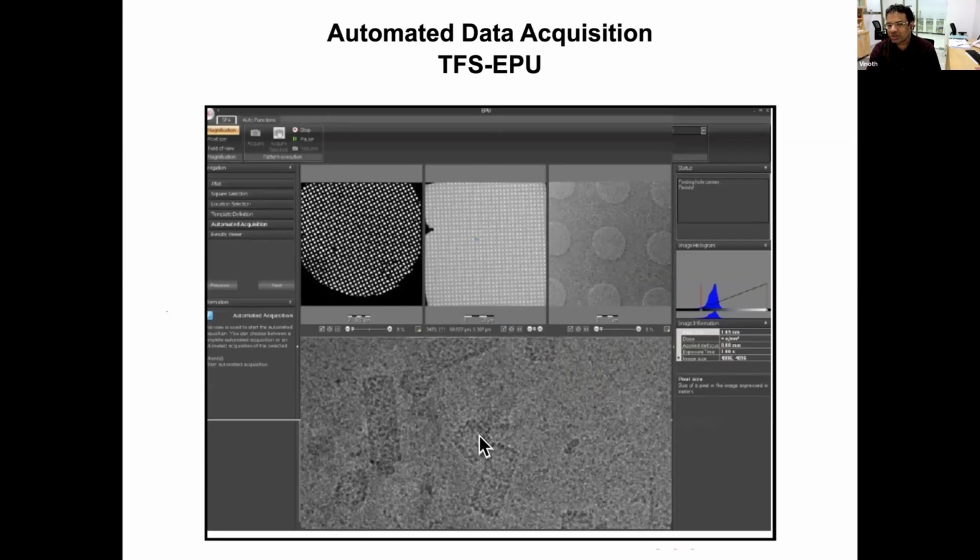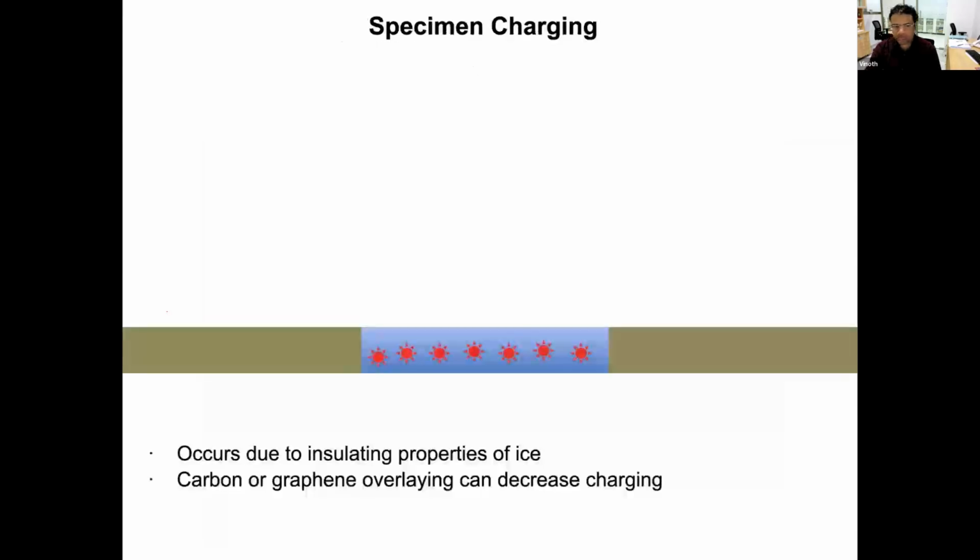And it's always useful to check every now and then that it is going on. It can stop for many reasons. One could be software, one could be there is no nitrogen, or one could be because the eucentric height was wrong. So it's always useful to check because most of the facilities, time is the limiting factor, so it's better to check what is happening.